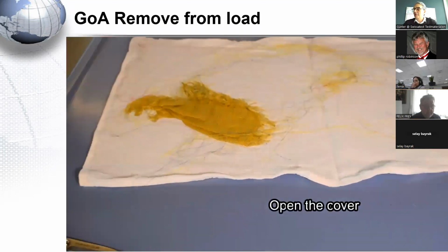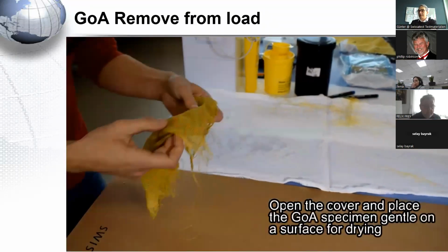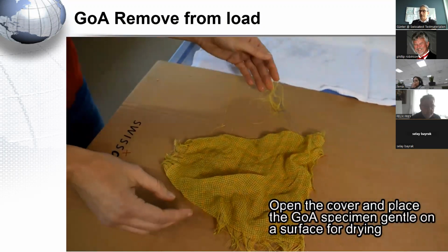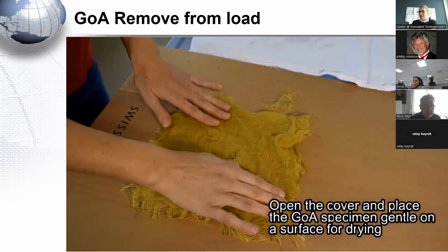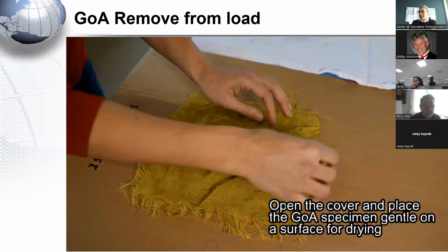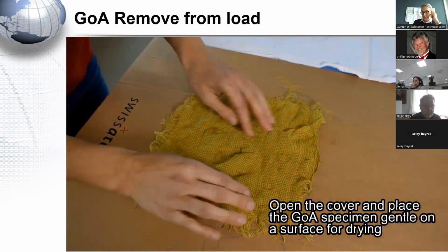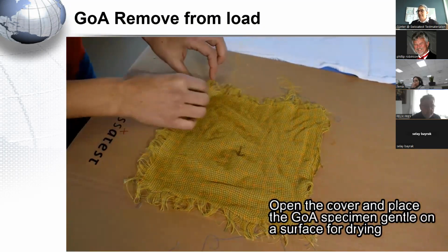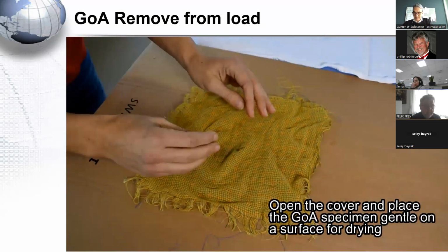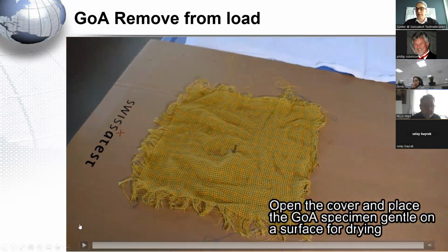And here you see a lot of loose threads and how the GoA sample lays in the towel, and then how it is placed on a cardboard for the drying. Place it gently, don't put too much mechanical action on it. And then you can put it somewhere to dry.